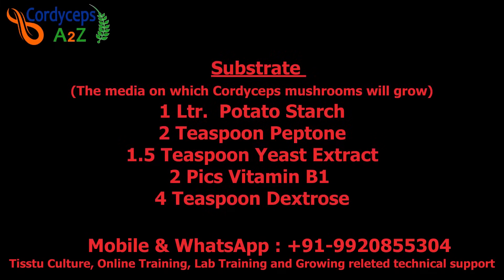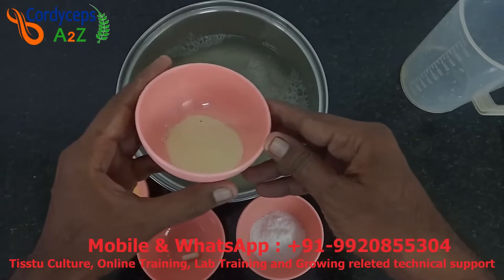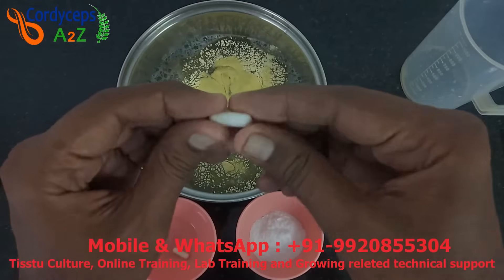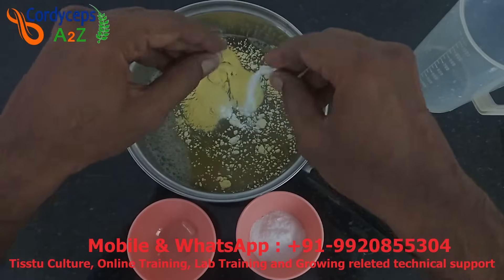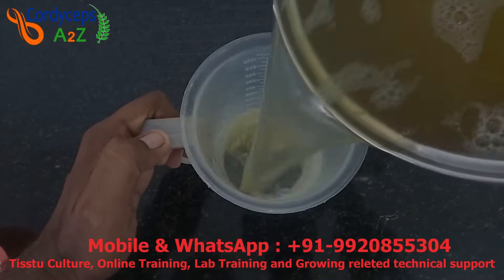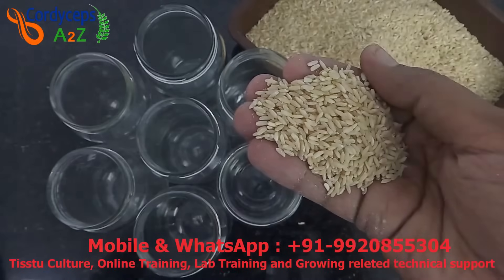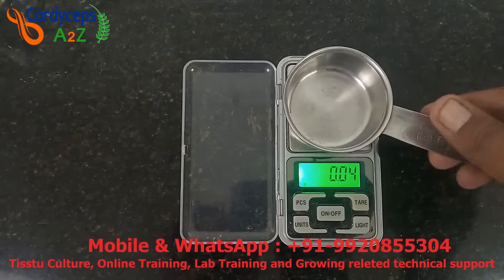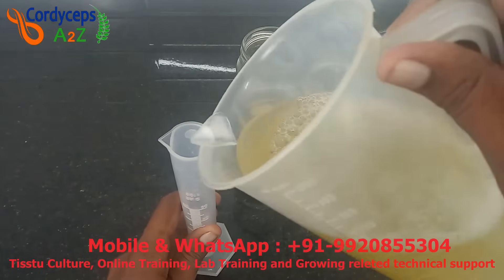Now we prepare the substrate. For the substrate liquid we need: 1 litre of potato starch, 2 teaspoons of peptone, 1.5 teaspoons of yeast extract, 2 pieces of vitamin B1 capsule or tablet, and 4 teaspoons of dextrose. Mix all ingredients well and put the mixture in a measuring jar. I have taken 400 ml glass jars. I am using unpolished rice — you can also use brown column rice or brown basmati rice. Put 20 grams of rice in each bottle, then 40 ml of substrate liquid in each bottle.